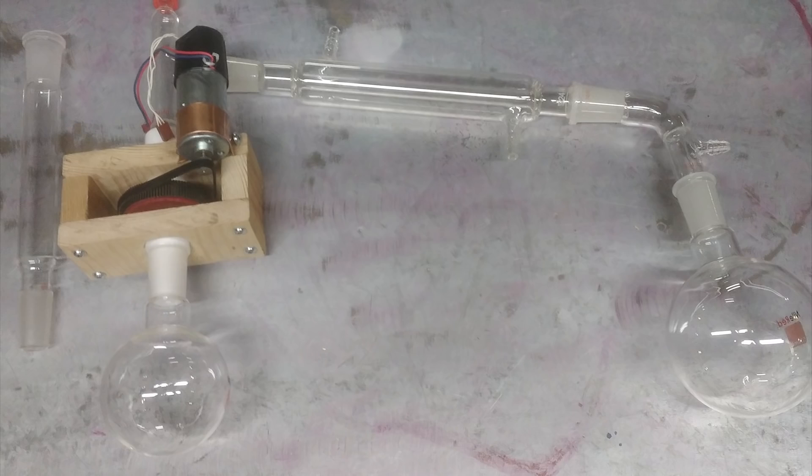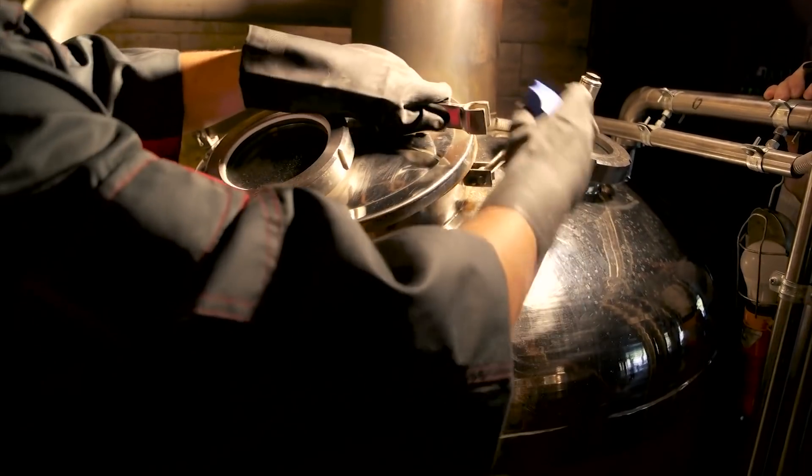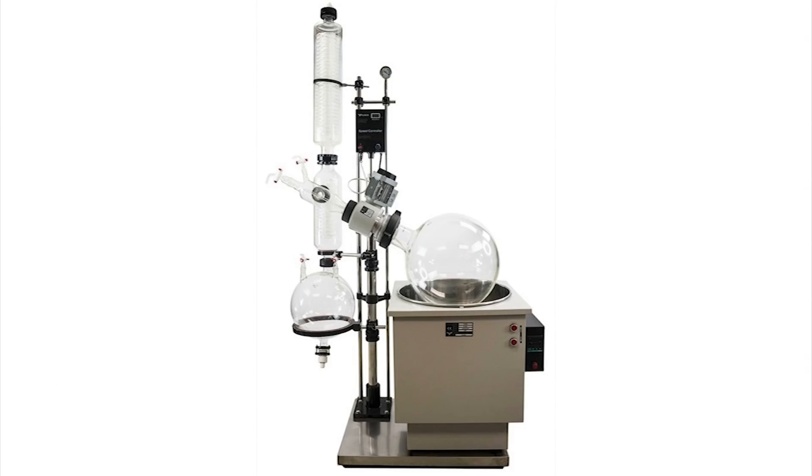A rotovap is essentially just a really fancy distillation system, but unlike a normal distillation where you need to heat your substance to boiling to move the solvent, a rotovap uses gentle heat, rotation, and vacuum pressure to move the solvent from things that are either too delicate and/or too stubborn to be distilled or dried normally.